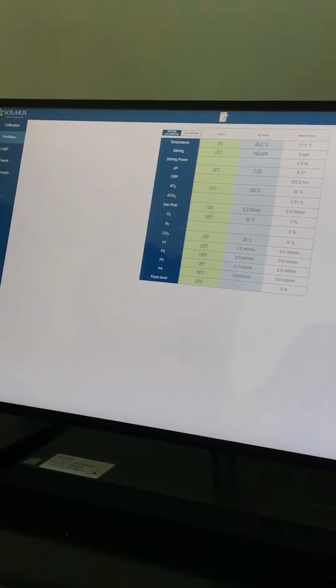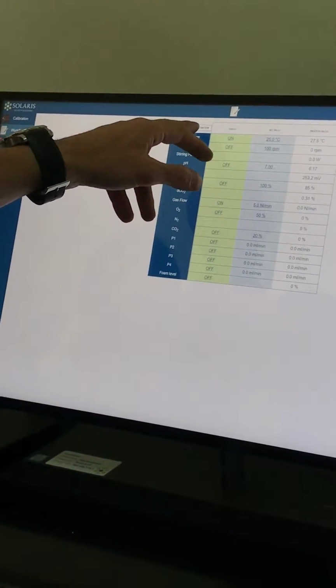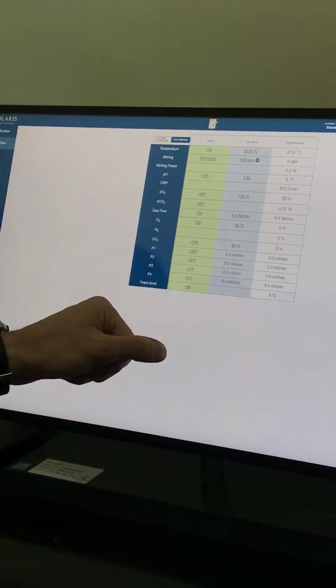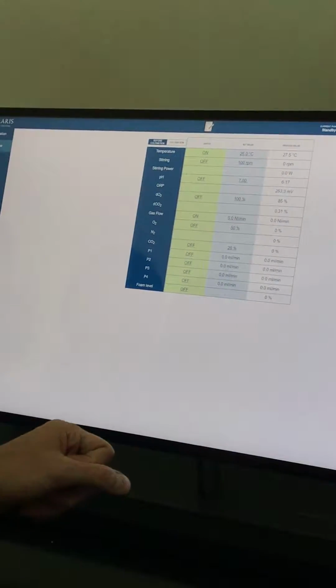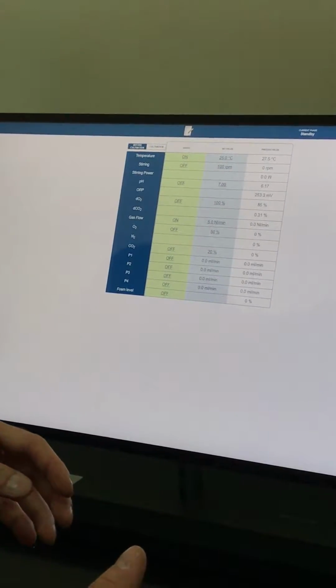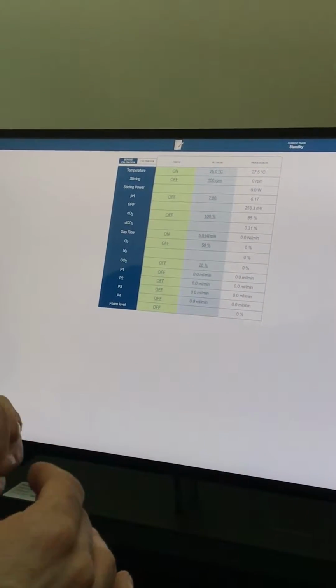Okay, I repeat. You will see two tables, before cultivation and cultivation. What is the reason? In before cultivation, you will reach the best condition for the microorganism growth, okay?